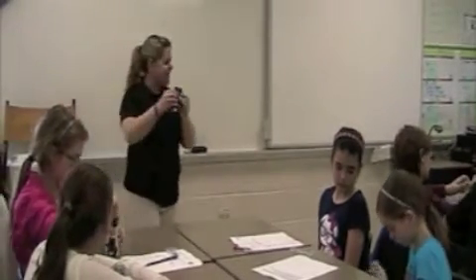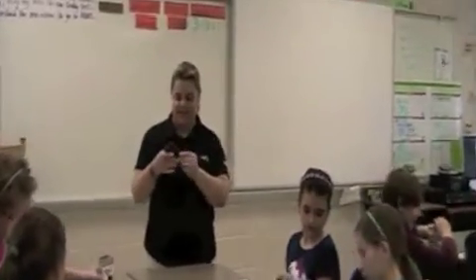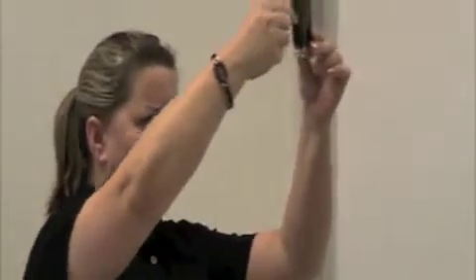It's small, isn't it? It's a travel microscope for us traveling scientists. Now, there's a couple of wheels on it. Look where I'm pointing. What does the top wheel say above it? Zoom. And then right under the word zoom, what does it say? Focus. But right under the word zoom, what does that say? 100x, and then a little arrow, 60x.